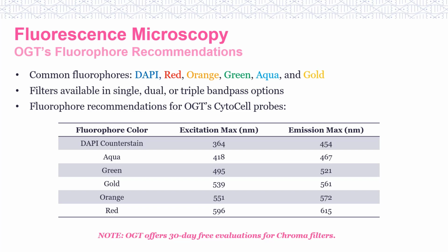For several years, the College of American Pathologists, or CAP, has included an item on the All-Common Inspection checklist regarding this issue. In the Instrument and Equipment Maintenance Function Check section, requirement COM 30685, Microscopes for Fluorescence Testing, states that the microscopes used for fluorescence testing are used with filters and slides appropriate to and verified in conjunction with the test or tests being performed.